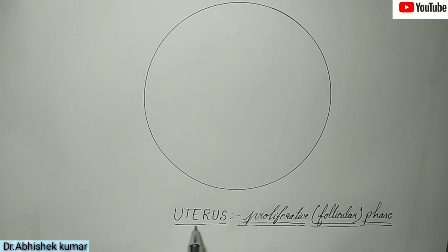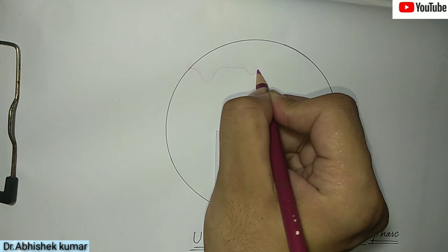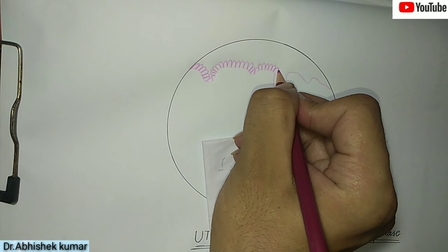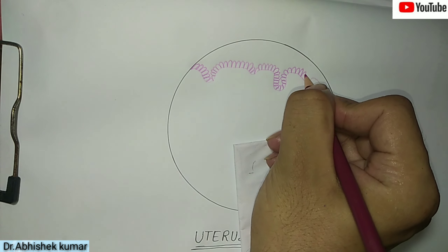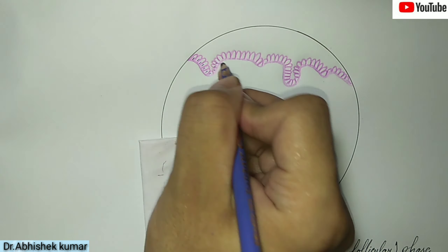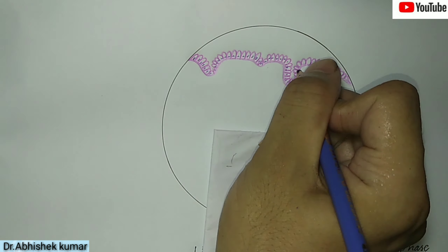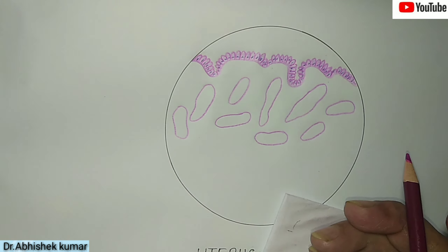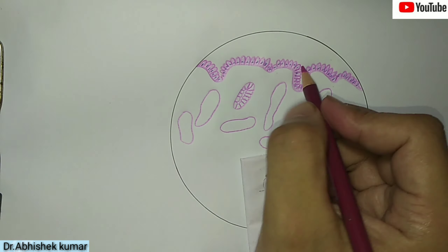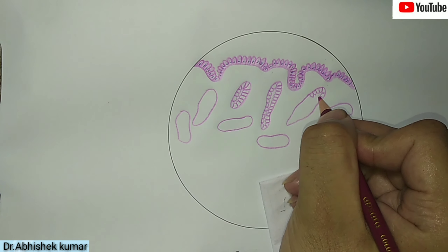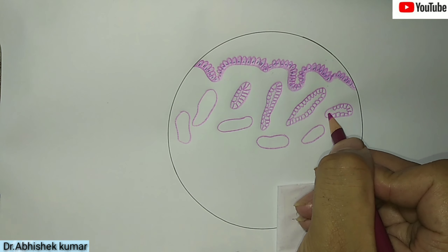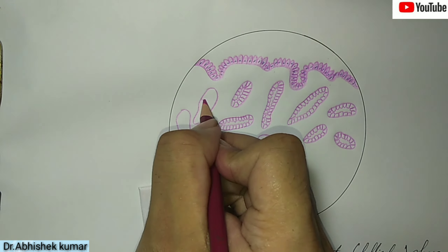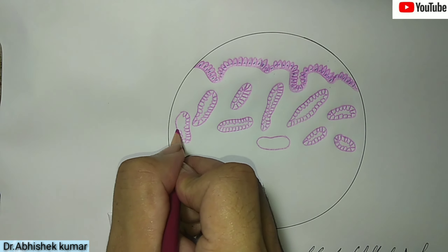Now we will see the proliferative or follicular phase of the uterine tube. Here you can see the surface of the endometrium, which is lined by simple columnar epithelium cells — this is the lining epithelium. Also present are uterine glands, lined by simple columnar epithelium cells.